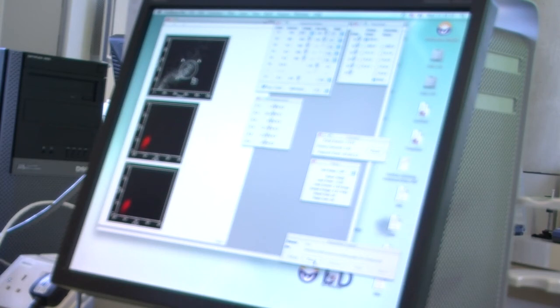Now, of course, if all the other profiles are the same for the different plots, so if it has spots and big teeth and claws and a long tail and it's cat-shaped, then it's a pretty good bet it's a leopard. Whereas if it's got spots, but it's actually got really heavy shoulders and really big jaws, it looks more like a dog, it's probably a hyena. And so it's all about looking at the similarities. And actually, it's not a bad analogy. I have to remember that one for future use. Because that's sort of what it comes down to.